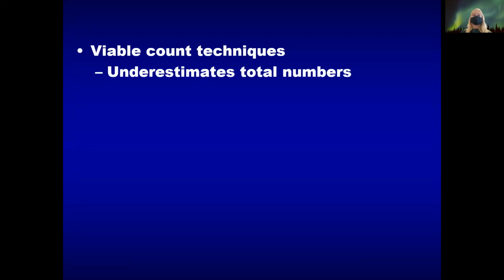So again, just emphasizing the viable plate count technique. It is publishable. I like doing it. I do it almost all the time when I'm running experiments. That's part of the process. But we know it underestimates. But we all know that. So as long as we're all aware of that, it's fine.